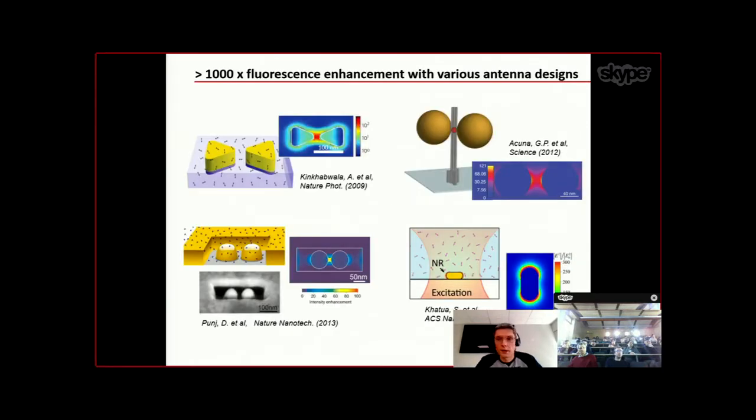There have been several demonstrations to do that. Several groups have achieved fluorescence enhancement above 1,000. You have the group of Bill Moerner, who was the first to go into this. Philip Tinnefeld has already shown you on Tuesday this DNA origami. I will go back to this one. In my group, in collaboration with Niek van Hulst and Maria Garcia Parajo, we have also achieved a thousand-fold enhancement, and also Michel Orrit, using a very simple system, just a gold nanorod, also could get a thousand-fold.